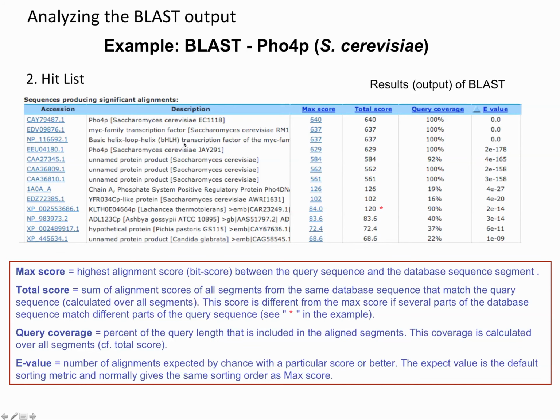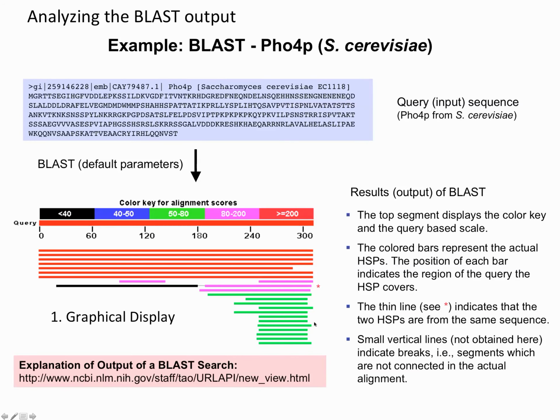Also, there are listed the score values of the corresponding alignments of all hits with the query sequence and the regions that they cover from the original sequence. These low values represent small fragments that were obtained from the comparison of the sequence.